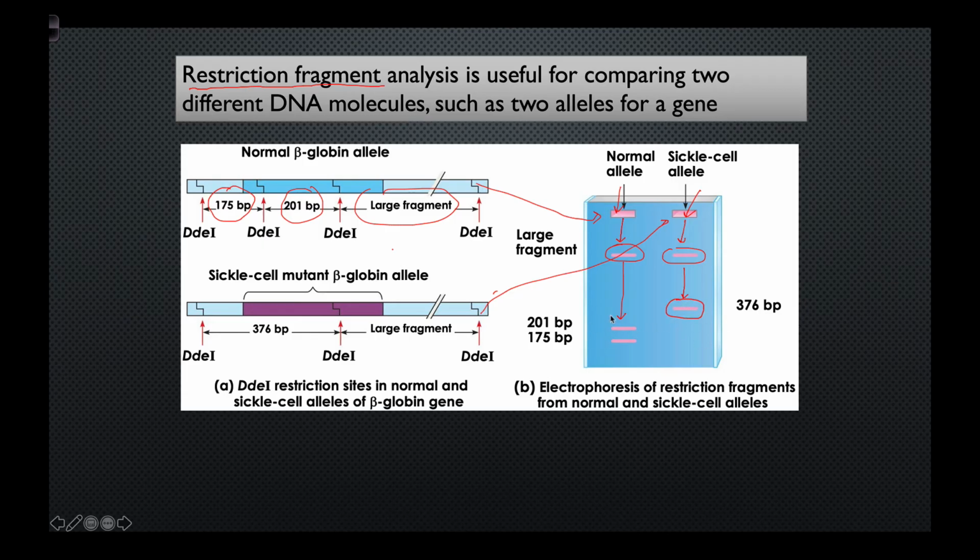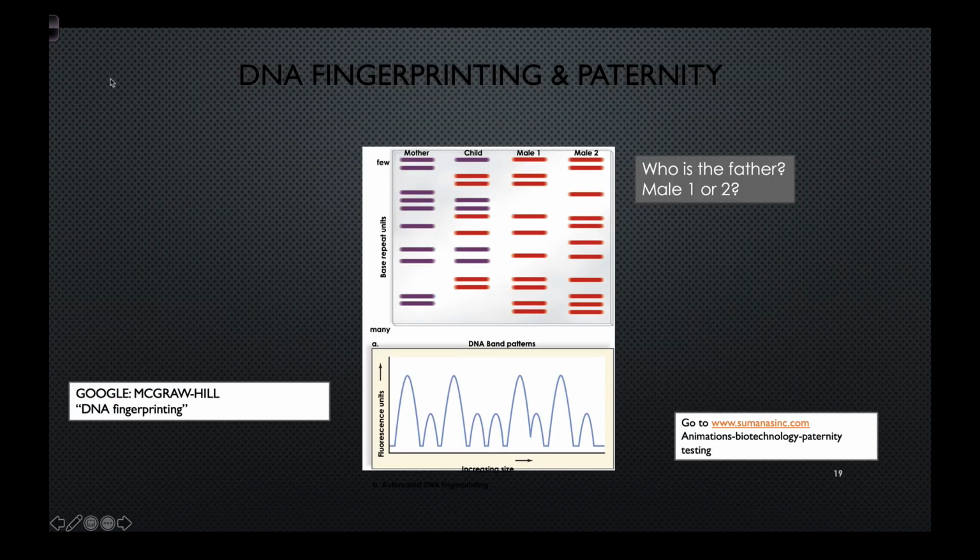So you can see clearly these 2 strips of DNA are not identical. This one has 1, 2, 3 different clumps of DNA that got stuck, and they happen to be at different locations than the 2 that you see here. This one here does match, but this one here has no match in this strand, and these 2 clumps of DNA have no match in this strand here. And that would tell someone visually observing these 2 strands of DNA that they are not identical to one another.